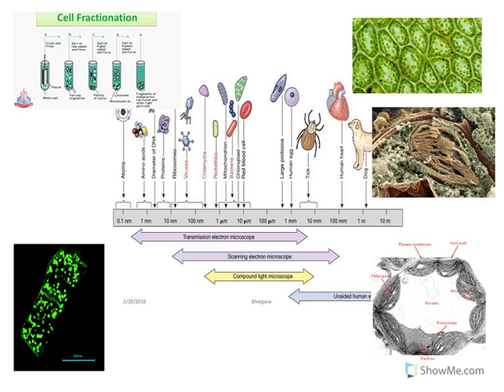So, as you know, in biology class you've always looked through a microscope at cells, and you probably haven't seen very many details when you've looked under the microscope. You've seen something like this when you look at a light microscope. So how in the world do scientists know all the details of the organelles inside of the cell?